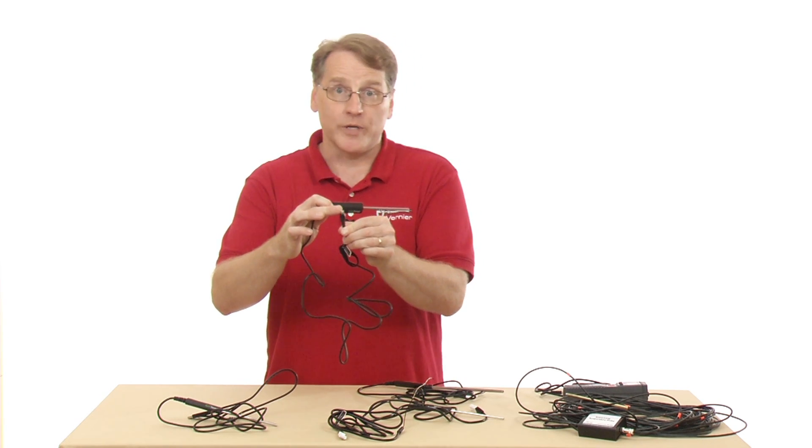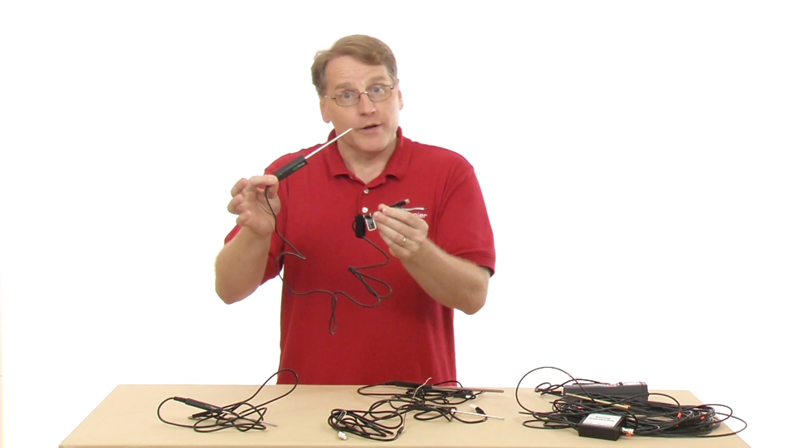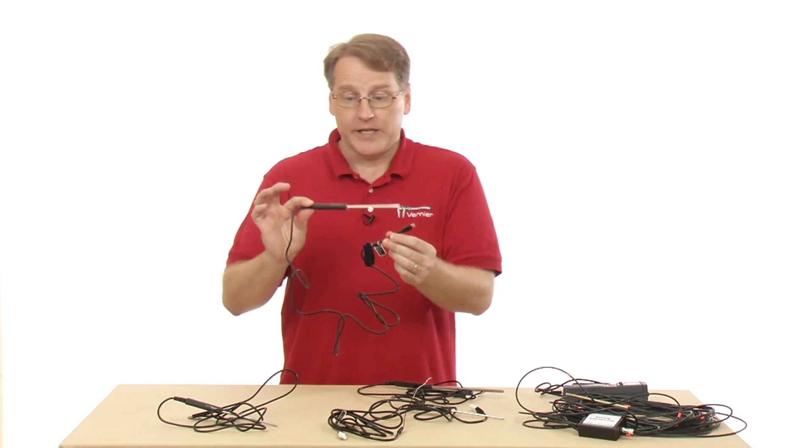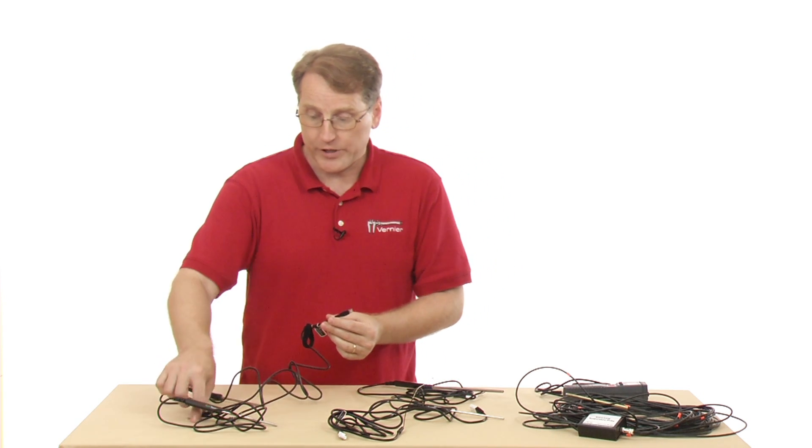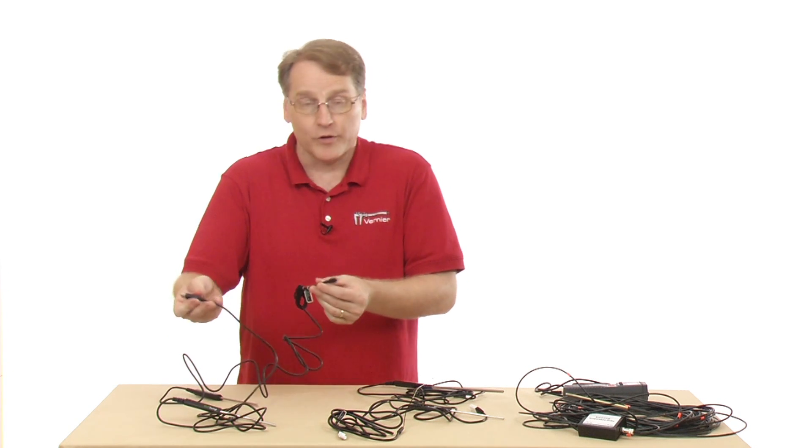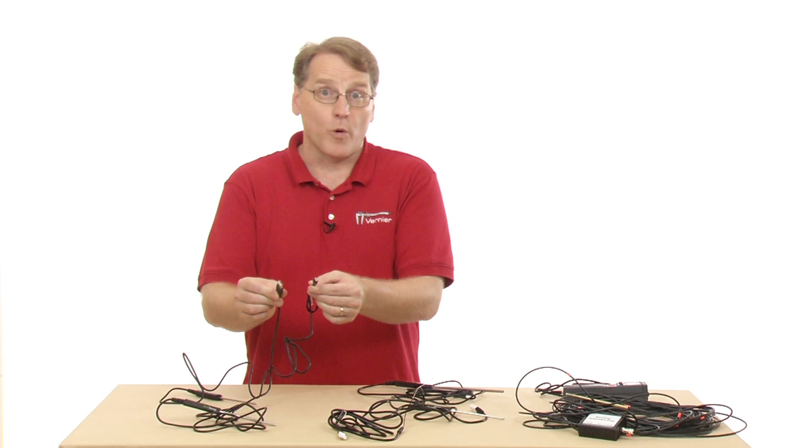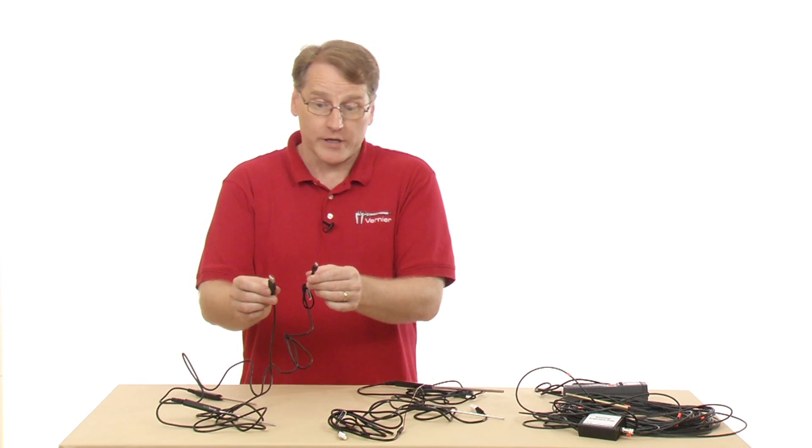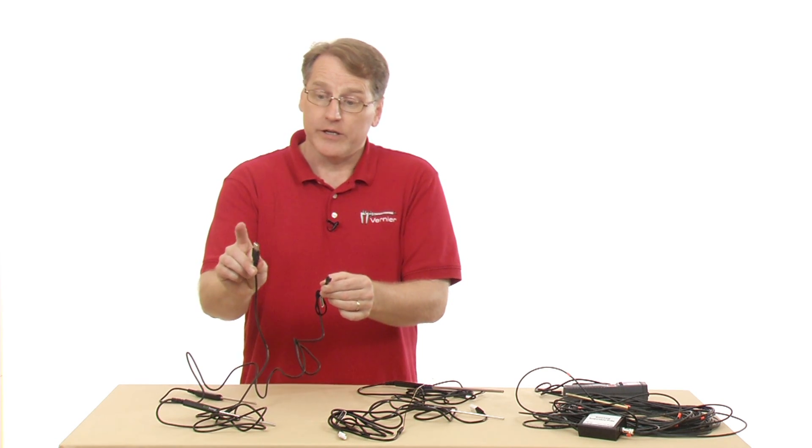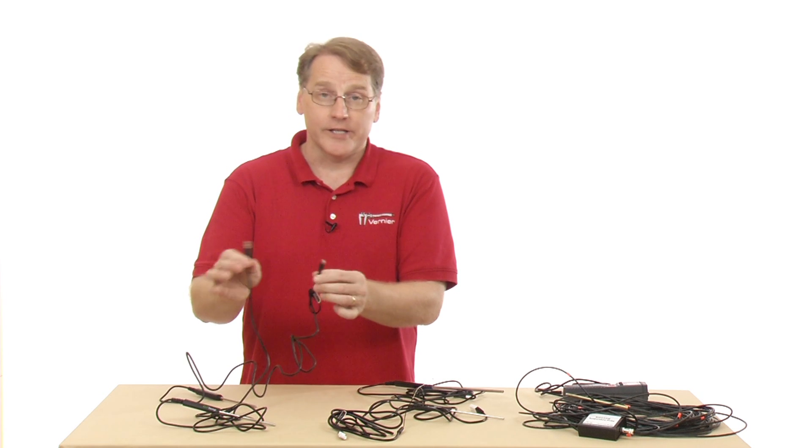So it has a mini USB port that's there. Now it turns out that the EasyTemp and the GoTemp are actually very similar electronically. The main difference is the size of the USB ports. And we do sell adapters that allow you to make the GoTemp into an EasyTemp or vice versa.